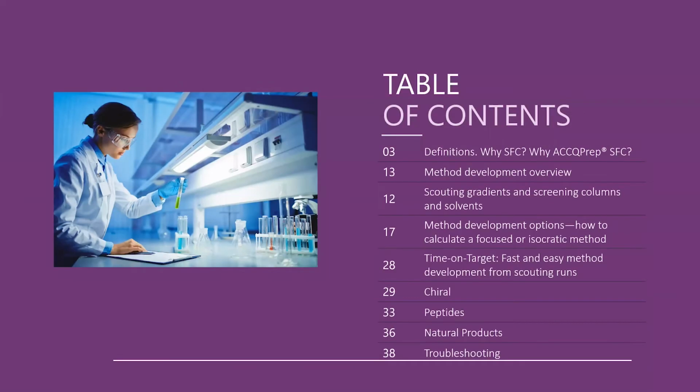We will discuss some definitions and explore why we use SFC and why Teledyne ISCO SFC. We will discuss the steps for method development, starting with scouting gradients and column screens, and then how to create focused or isocratic gradient methods from those scouting runs.